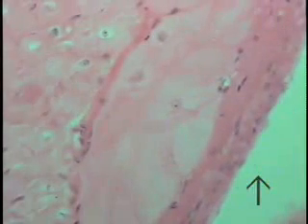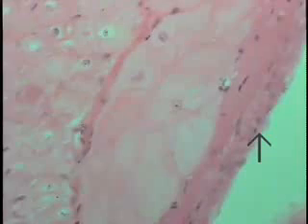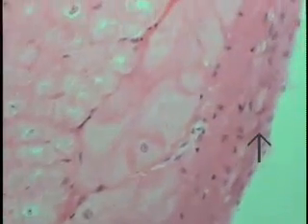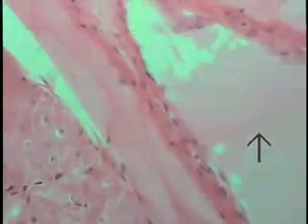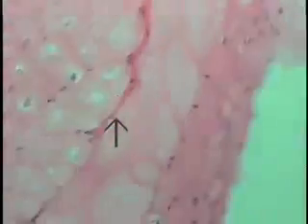Here we're running into some more that are lying in the endocardium, which extends from where the tip of the arrow now indicates to this, even though it's rather oblique or an off-angle type of cut, just to give you an idea of the size of these particular cells and their relative abundance. And here we're getting into some that are cut more obliquely as they're lying at this particular location. So these are the Purkinje cells. Be sure these have been identified, and you can recognize them in the routine type of preparations.